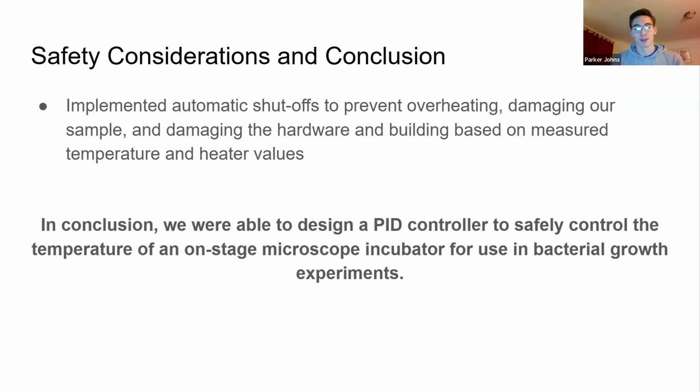And so with that, in conclusion, we were able to successfully design a PID controller to safely control the temperature of an on-stage microscope incubator for use in bacterial growth experiments.